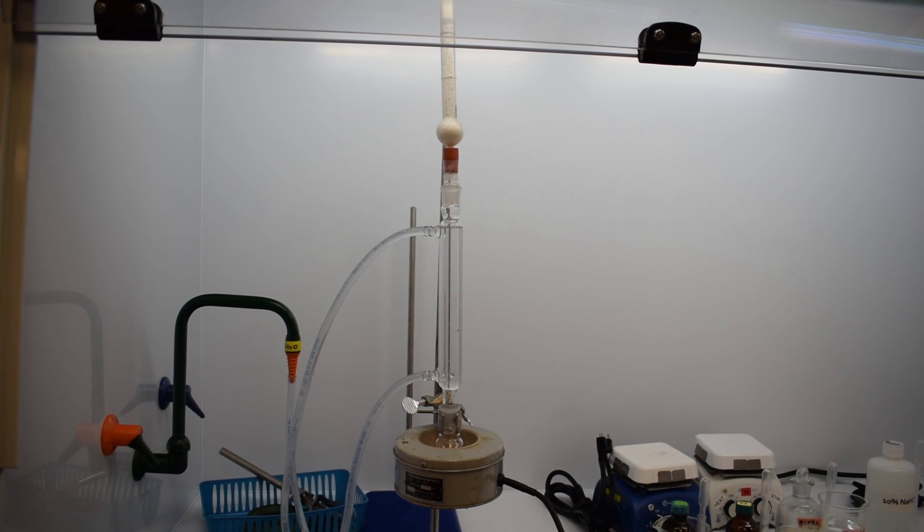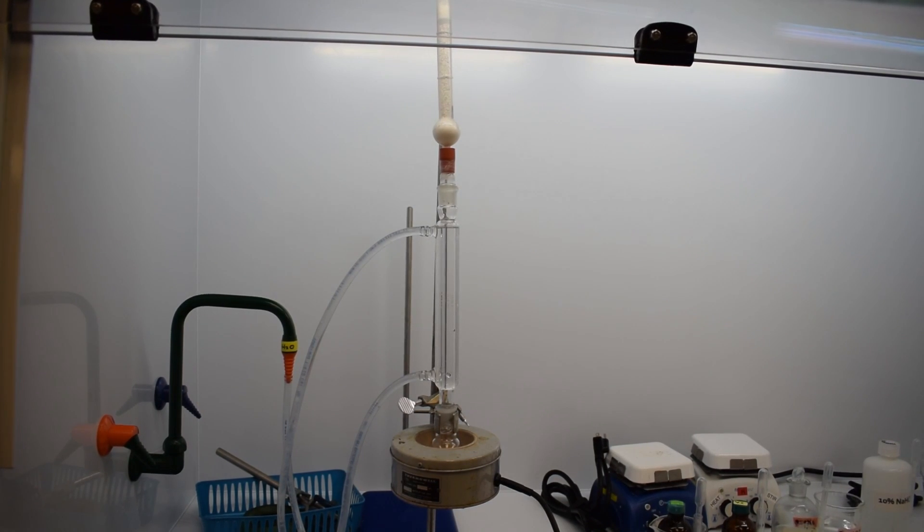This consists of the heating mantle on the bottom, the round bottom flask, a reflux condenser, and calcium sulfate drying tube on the top.